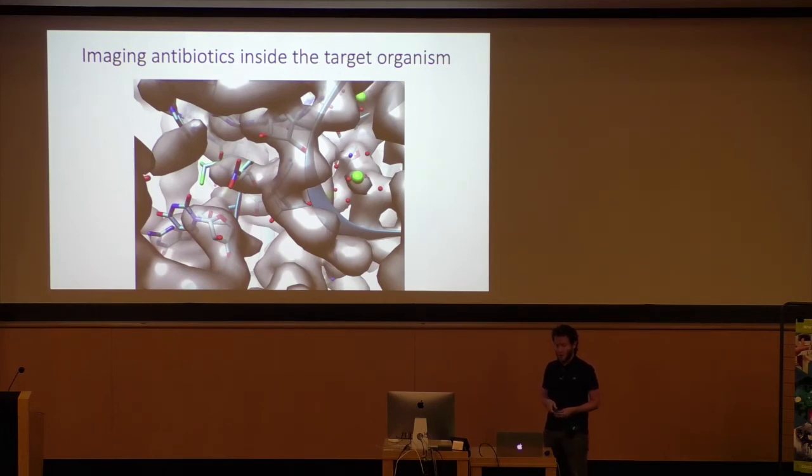Now, I know this is not a FIB lamella. There are certainly a few more things that are a bit more difficult about FIB lamella, but I'm very hopeful that we could soon achieve similar results in FIB-milled eukaryotic lamella.